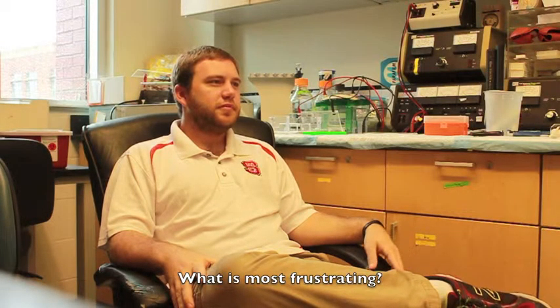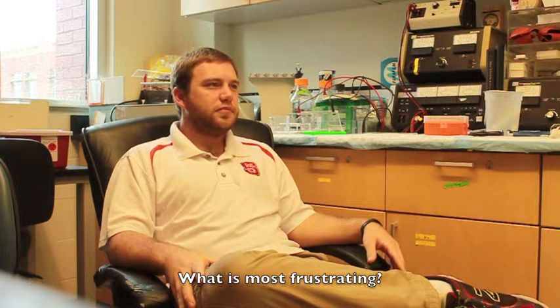So what is the most frustrating thing about using a confocal microscope? It's not just the microscope itself. It can be kind of dim and hard to work with. The other problem is also going to be the imaging of whatever you're looking at. When it comes to laser confocal microscopy, you have a lot of small things you have to work with.